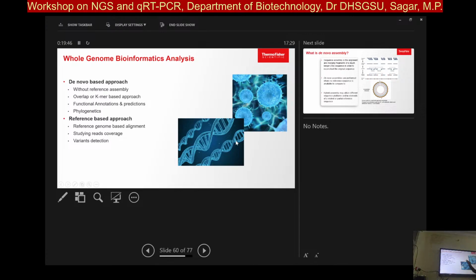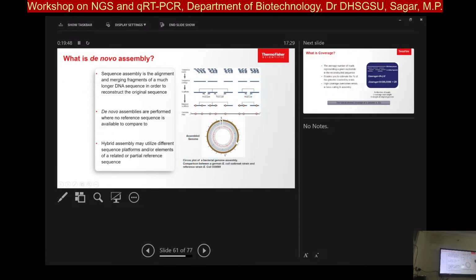So two types of techniques, but what could we do is something like this: short reads, right? And with short reads, okay, it can assemble into contigs. Again, the same assembly could be paired together by paired end reads, assemble again and make more scaffolds out of it. And the same scaffolds would actually make up a genome if you apply the backbone of a genome. So you try to look for a closest genome and try to map that and make a genome out. So circularize the genome entirely. So this is a process of doing the work.